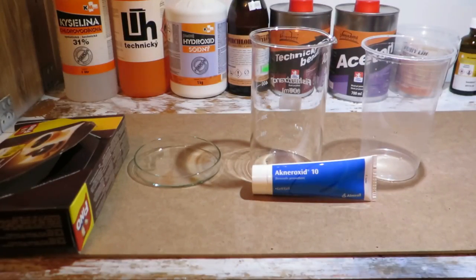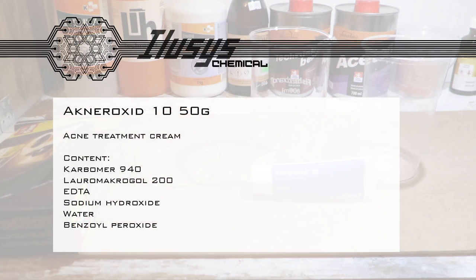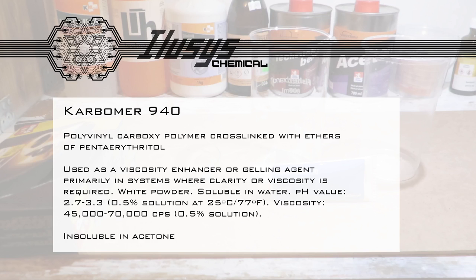In this video we will isolate benzoyl peroxide from acne treatment Akneroxid 10 cream. The product contains carbomer 940, which is a polyvinyl polymer insoluble in acetone and in basic solutions.